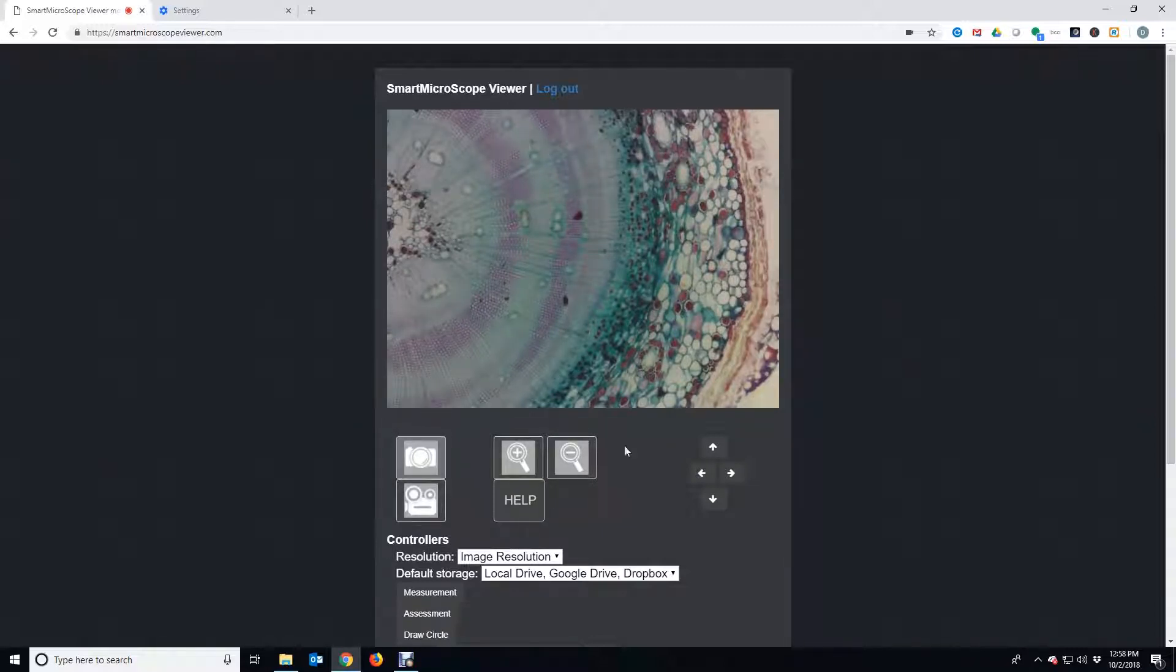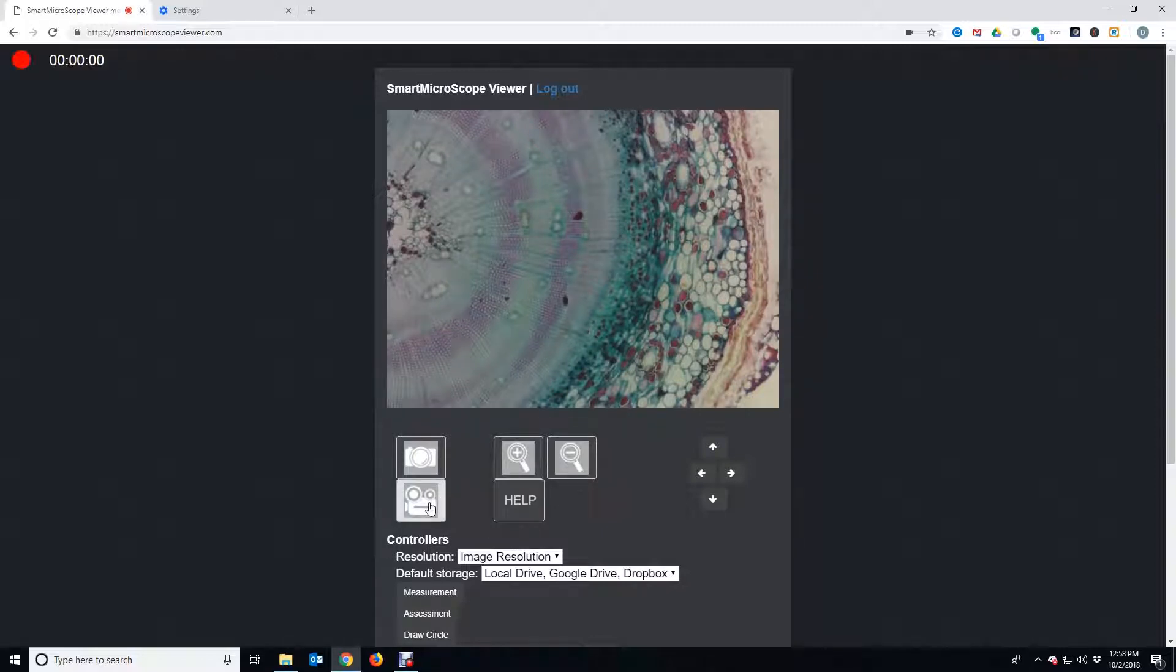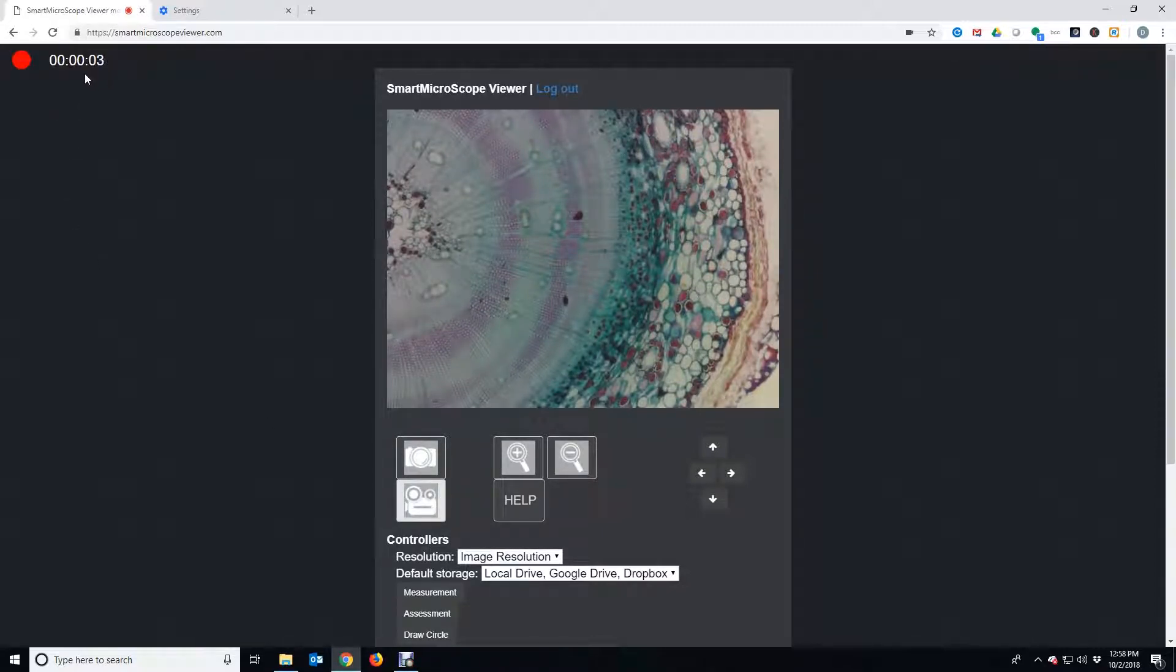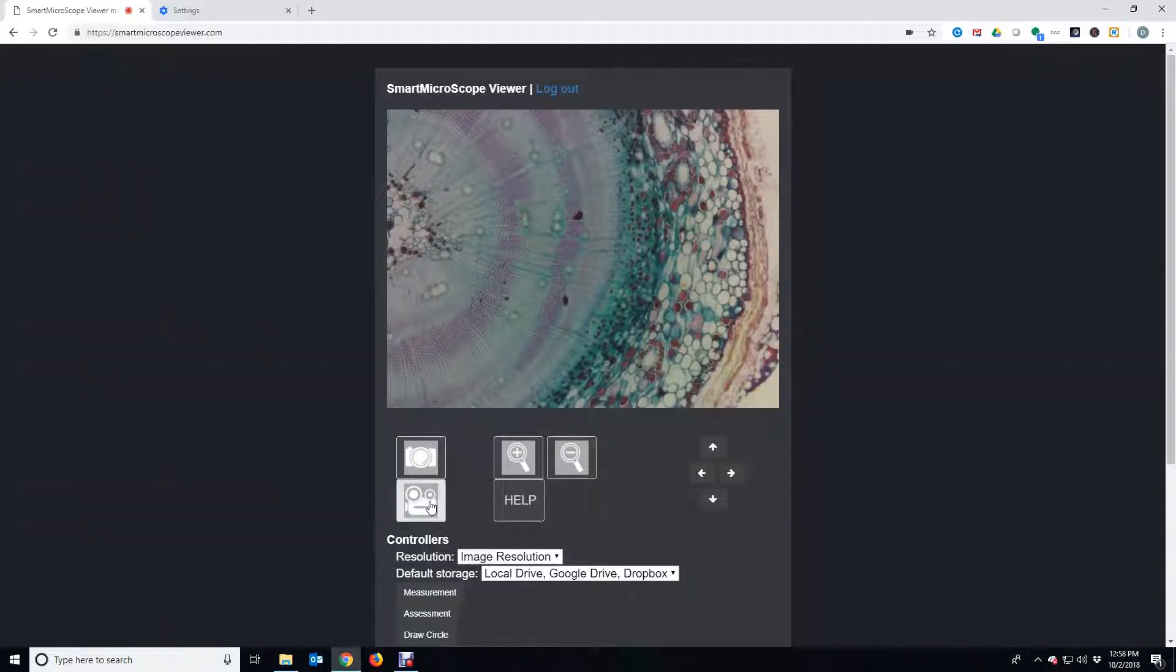You can take pictures and record videos. Notice the timer begins when the video starts and turns off when the recording stops.